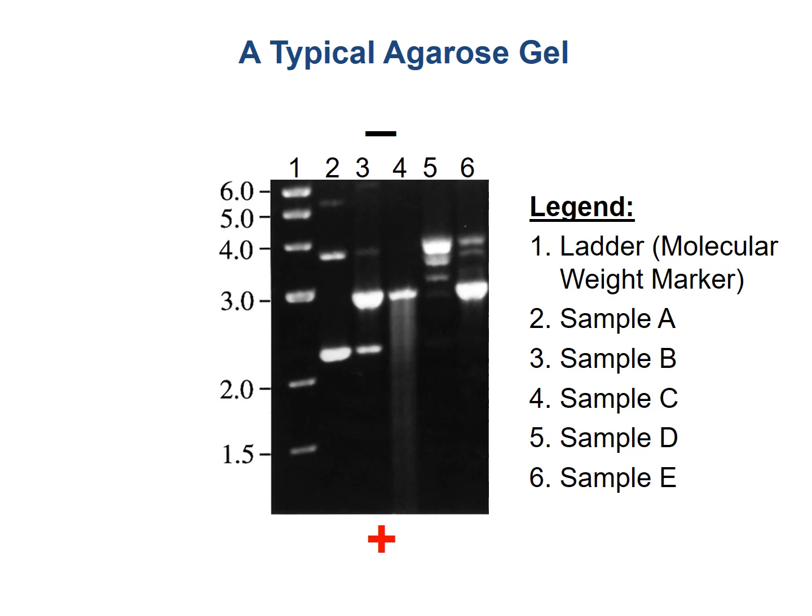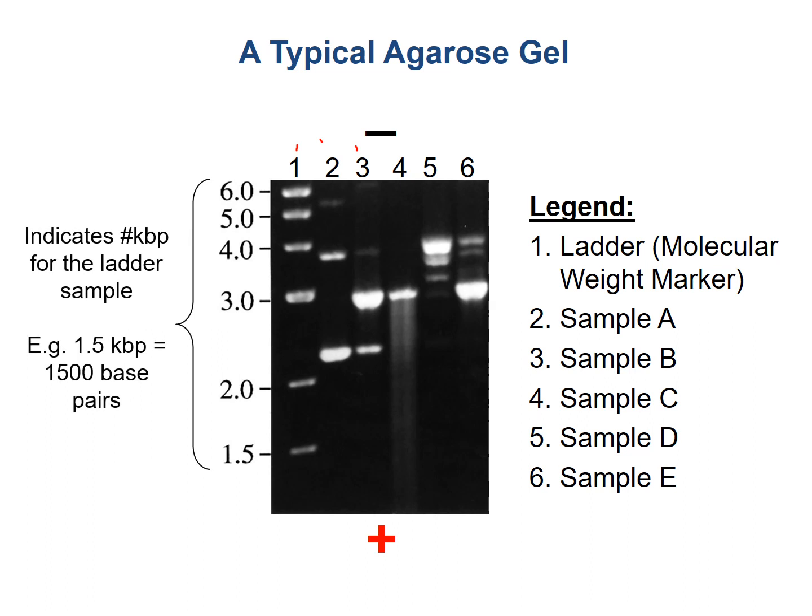You can see there are several samples loaded — one, two, three, and so on. Over on the right there's a legend. On the left is representing the sizes of the molecular weight marker. You can see each of these — six, five, four, three, two, and 1.5 — are representing the kilobase pairs.